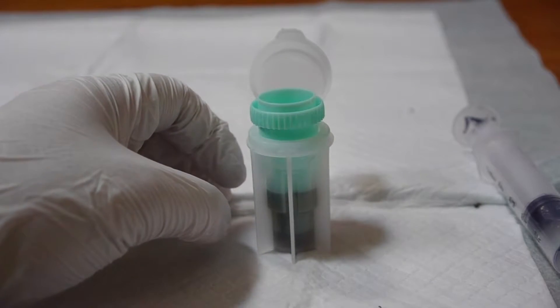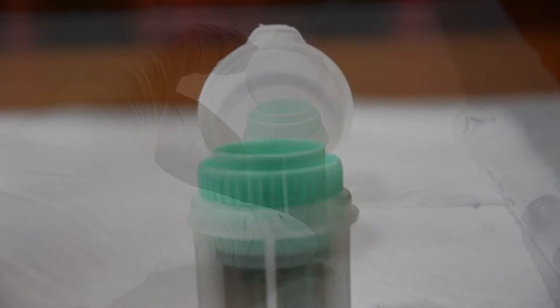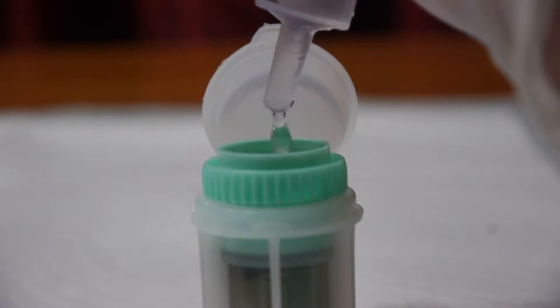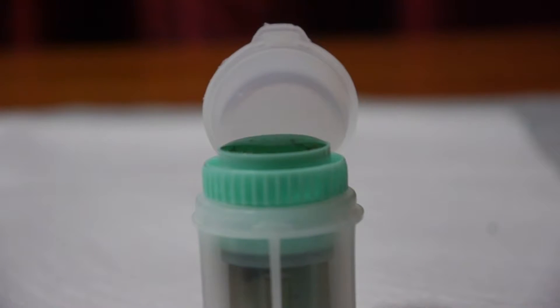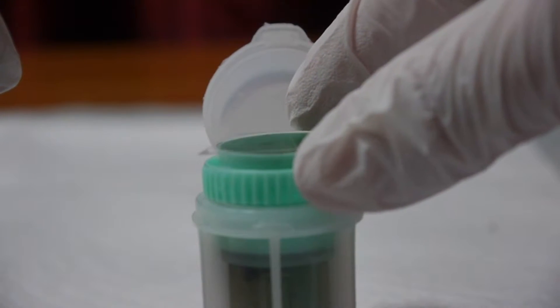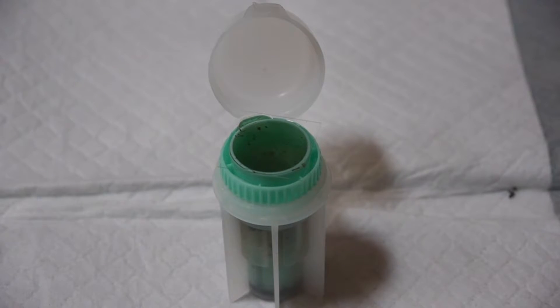Once it is all mixed up, push the center piece down so it snaps into place. I recommend covering the top with a paper towel to prevent any matter from splashing out. Use your dropper to fill the fecalizer all the way to the top until you see the liquid bubble up. Take a glass slipcover and place it on top of the fecalizer, making sure the liquid comes in contact with the slipcover. Leave the slipcover on for 20 minutes, allowing time for the parasites to float to the top while the heavier matter sinks to the bottom.